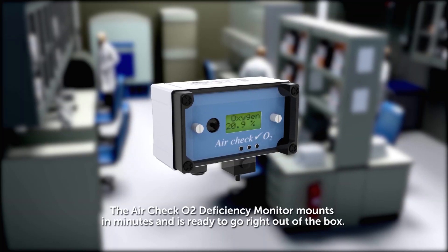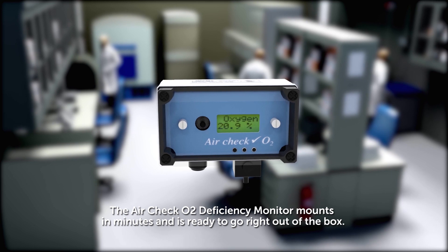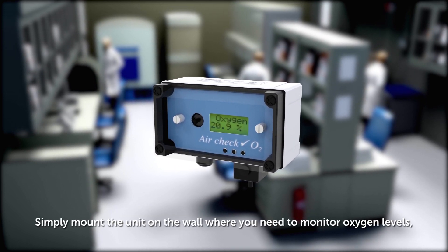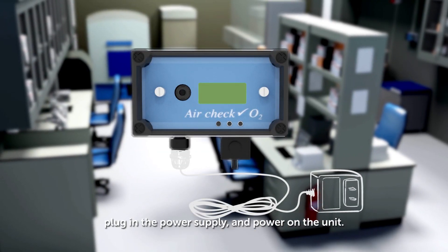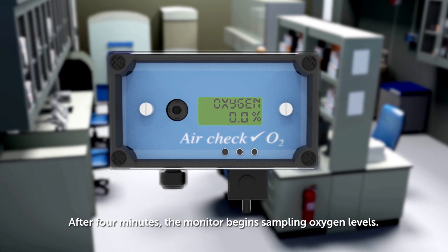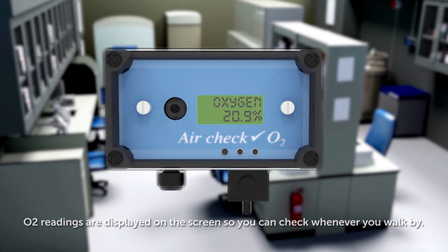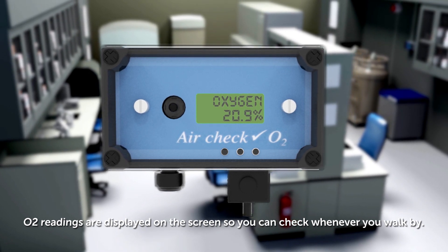The AirCheck O2 Deficiency Monitor mounts in minutes and is ready to go right out of the box. Simply mount the unit on the wall where you need to monitor oxygen levels, plug in the power supply and power on the unit. After four minutes, the monitor begins sampling oxygen levels, and O2 readings are displayed on the screen so you can check whenever you walk by.